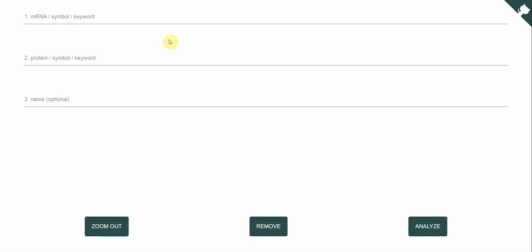This is the MitaFrame Open Reading Frame Finder. So this is a tool where you can plug in your mRNA and your protein sequence and it will try to find within your mRNA sequence whether the protein is encoded.